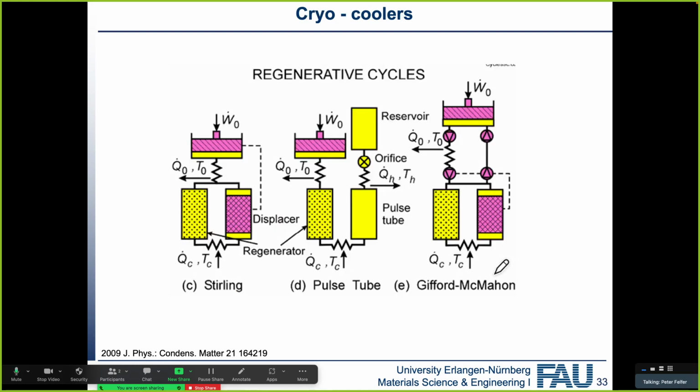Okay, which brings us to the cryocoolers. So the cryocoolers that we use are typically Gifford-McMahon cryocoolers. There are essentially three different types of cryocoolers, and we probably won't go through all of them, but I think you all know what a Stirling process looks like. So a Stirling process essentially means that you have some kind of displacer and regenerator, and you have heat going in here, and through compression of, in our case, helium, because at the temperatures we're at, only helium and hydrogen are even anything but solid. Everything else is already solid. So we're using helium.